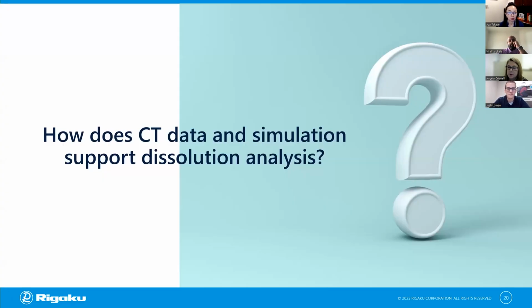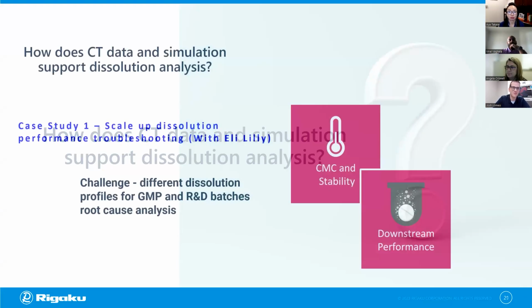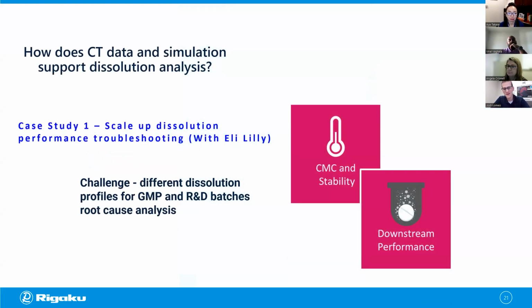The question here, Josh, is we want to know, how does CT data and simulation support dissolution analyses? That's a really great question, and where a majority of our pharmaceutical clients are coming to us with their challenges. I want to answer this through a couple of case studies that we have with clients on a couple of different drug product types.